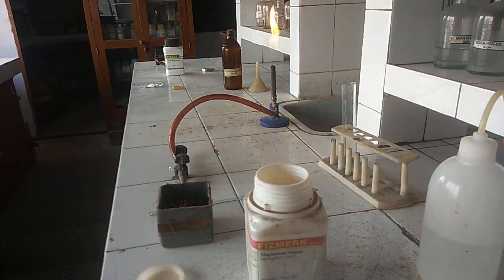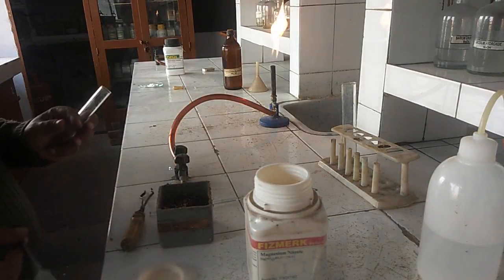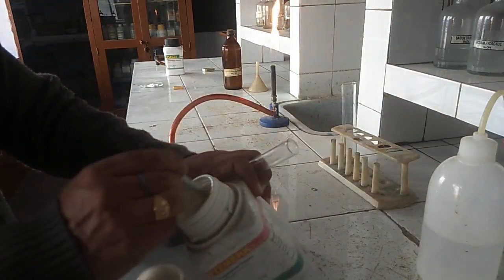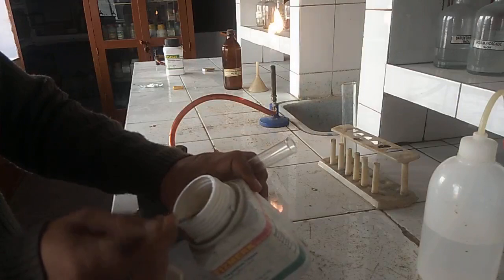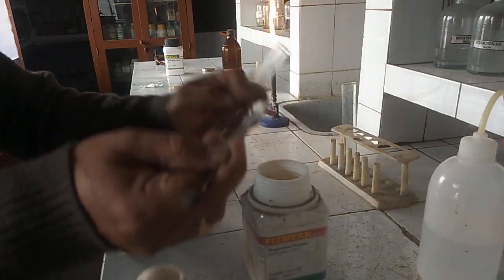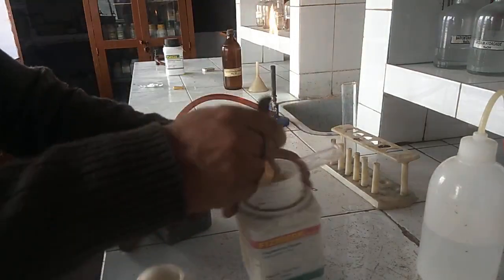Please do remember the reagents of all the three groups. Group 1 we have done with the help of dilute H2SO4. Now for group 2 we will use concentrated H2SO4, or concentrated sulfuric acid. For the test, again we will take a little amount of salt with the help of a spatula in a clean dry test tube.